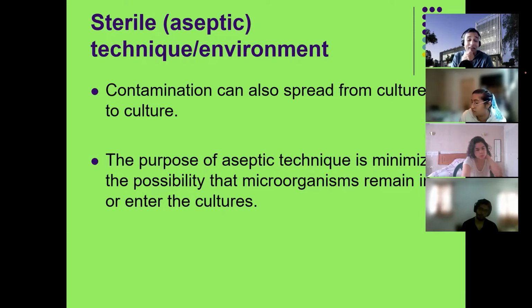They told me that if I have a contamination, just imagine that we are going to lose millions of dollars in a single day. So contamination is not acceptable anyhow. Everything is totally guided, monitored, properly tagged, connected and synchronized by computers. So whatever is entering the lab and whatever is coming out of the lab is 100% trackable. That is why they follow these guidelines, right? So they maintain it. And that is the idea. In the tissue culture lab, you should not have contamination unless you want them to grow within your plant, right?